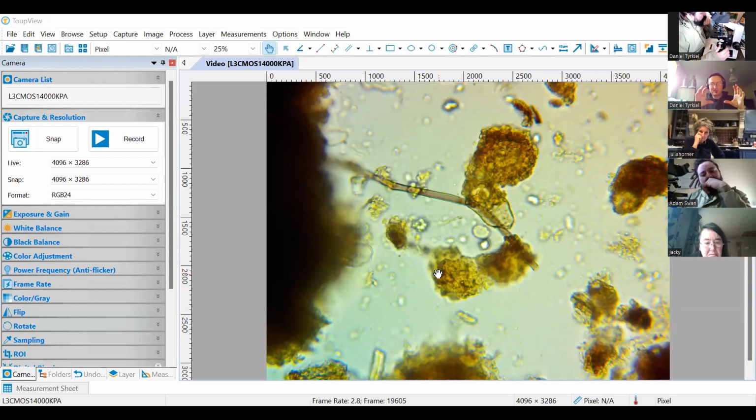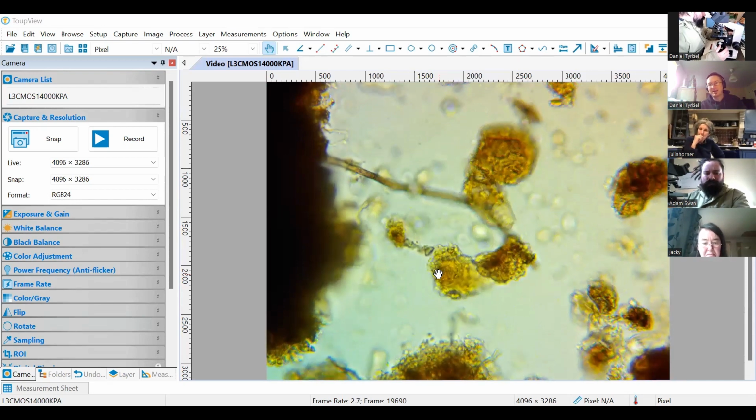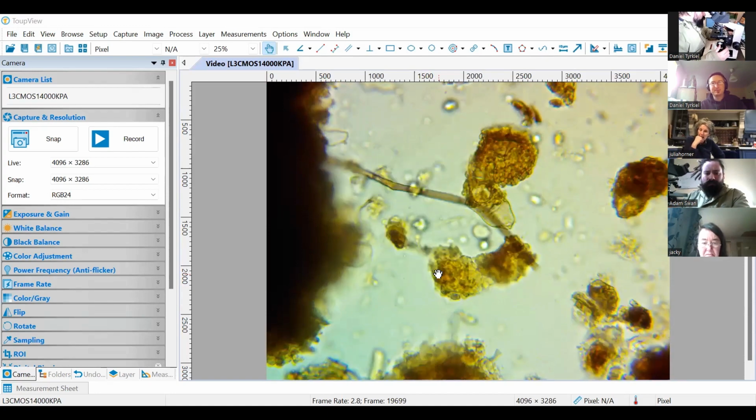And so if you don't see enough fungi, for instance, within that number, then you know that your confidence in the number is low. And usually taking more drops, even from the same sample, will not change that. It's just basically how little they are across that entire sample. The ones that give you confidence every time are bacteria. There's just so many of them that you never have a lack of confidence for the numbers that you're actually counting for bacteria.